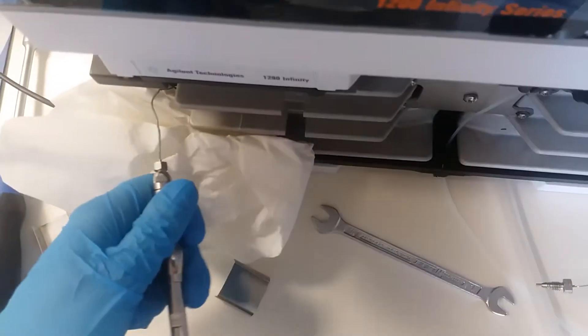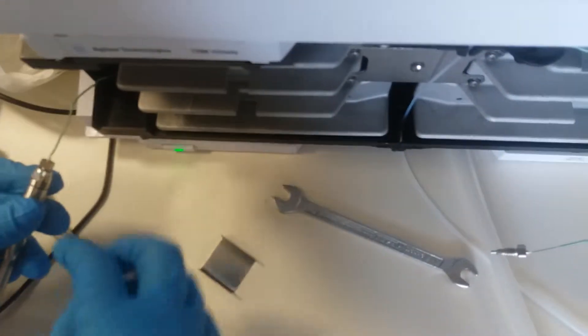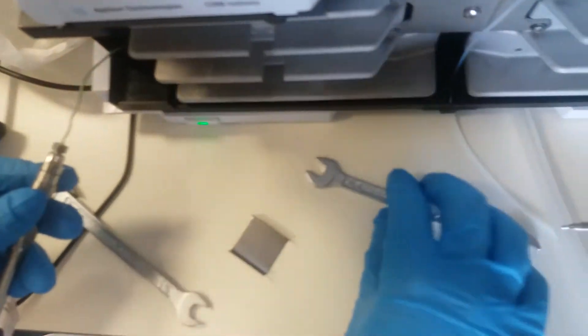This is not good. But this was where we were having leakage. Probably it's because this connection is not in good condition. We should try to change it.